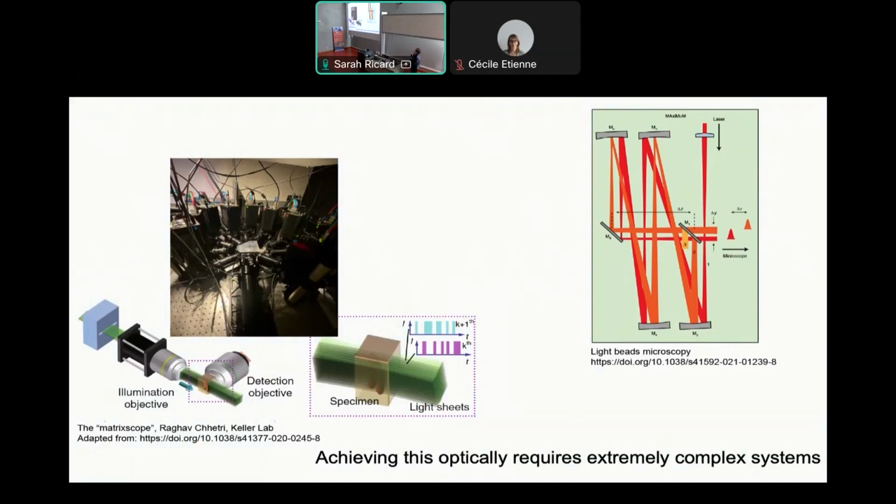So we're obviously living in the age of AI, deep learning, and we have a huge amount of data. So there's now a big switch in optical microscopy to say, do humans really know the best way to build a microscope to look at the thing that you're interested in? Or can computers tell us of a better design, right? And that's called programmable microscopy. And I just want to go into that.